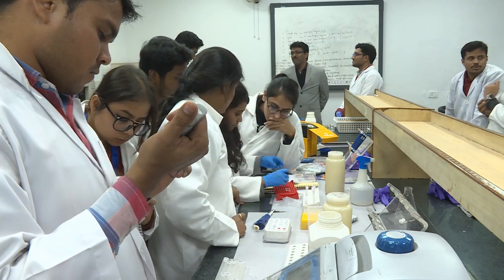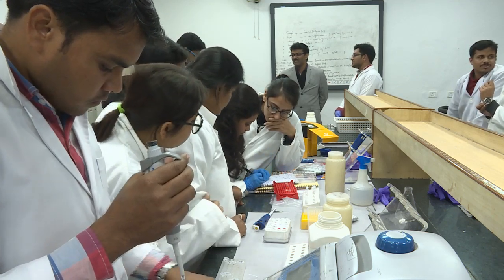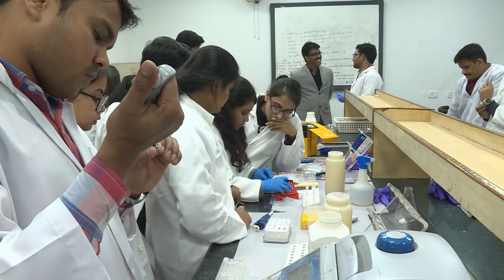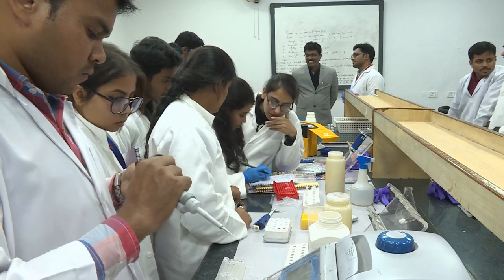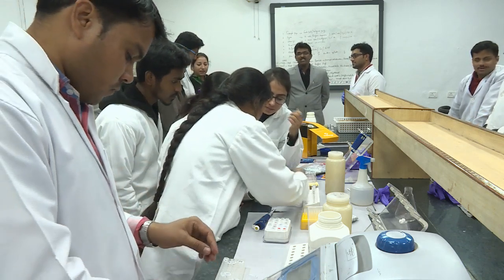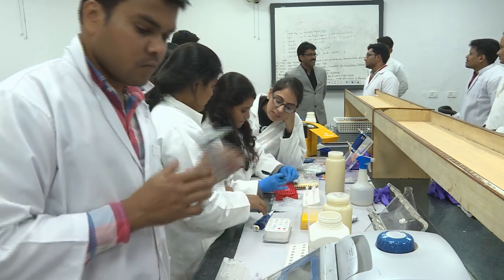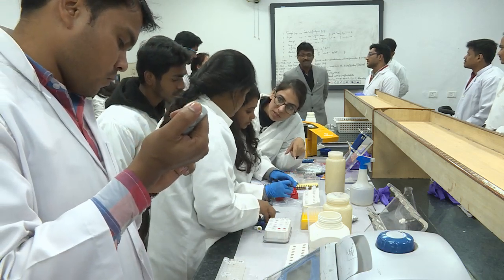Making mistake is always good because that gives you a number of opportunities and you gain a lot of experience. Yeah, fungal DNA isolation. The secret is how nicely you are grinding. First time working. Right now. That is another problem. Sample first time.